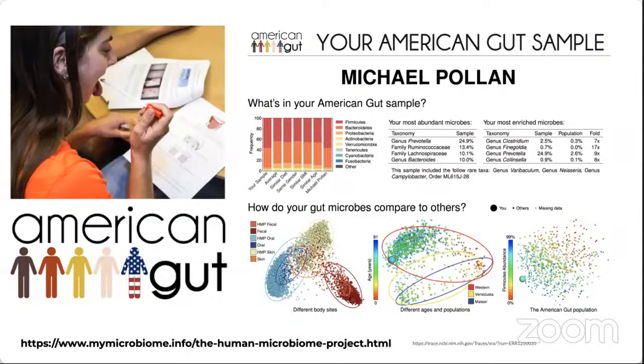Okay, thank you. So we already spoke about the Human Microbiome Project, and we have, for example, the American Gut Project, which can be used to find patterns in the guts, right? Patterns in the microbial population that can be used to study different ages in different populations, or that can generally be used to link to where these populations or microbes are actually sourced from. That can also be linked to several other comparisons, like the abundance level of specific microbial populations, etc.